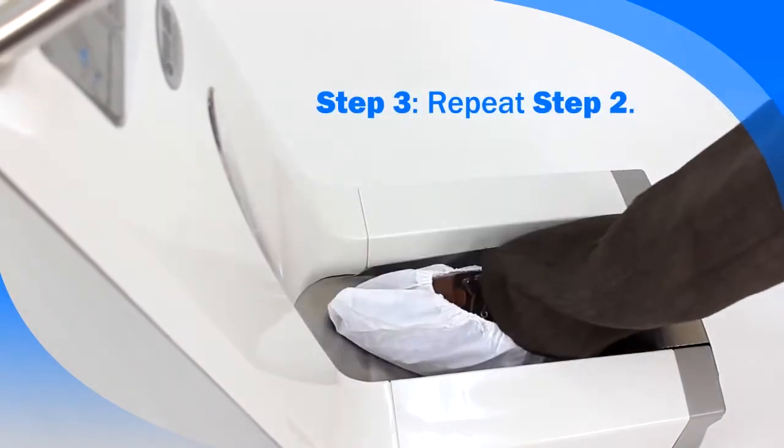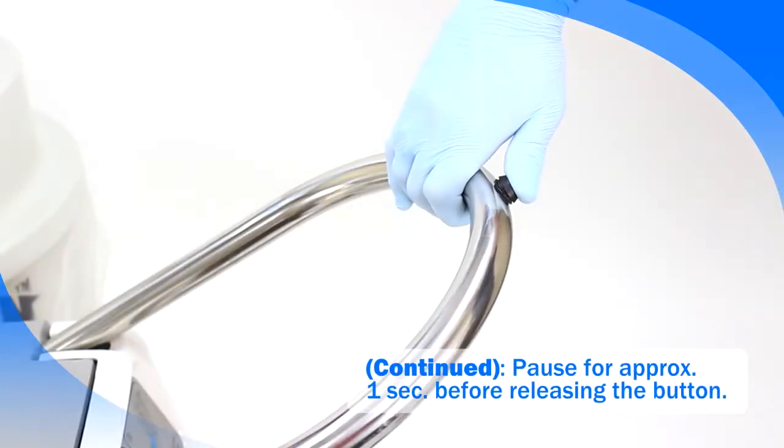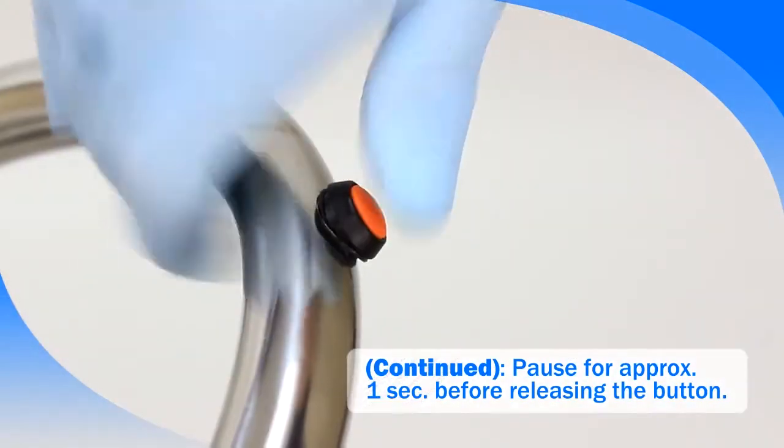Step 3: repeat step 2 with your other foot and pause for approximately 1 second before releasing the button.